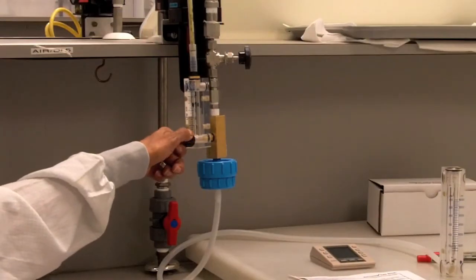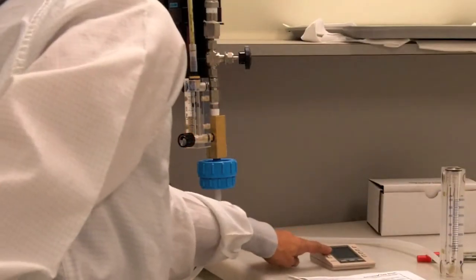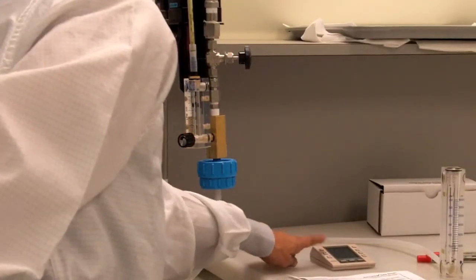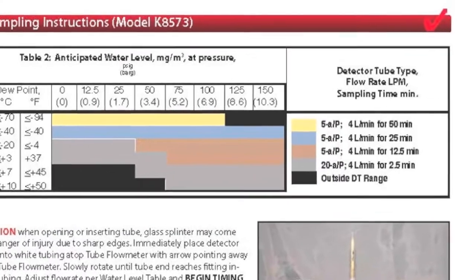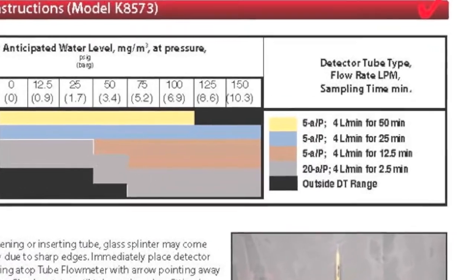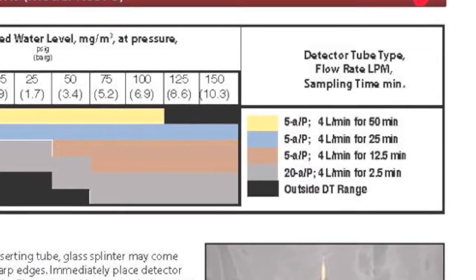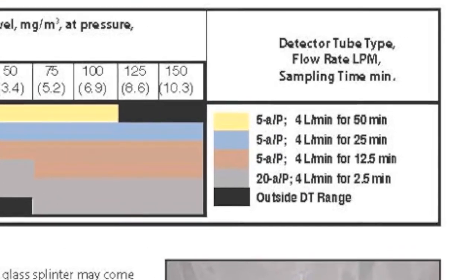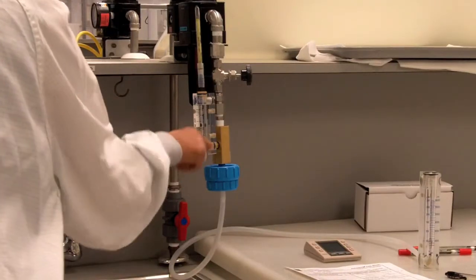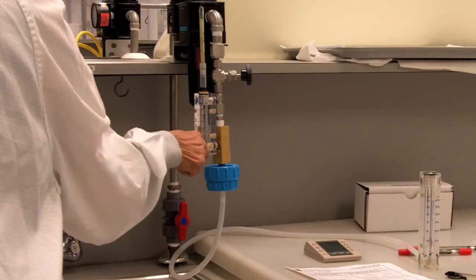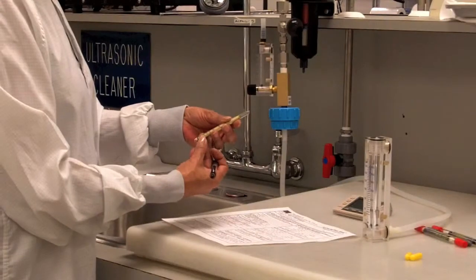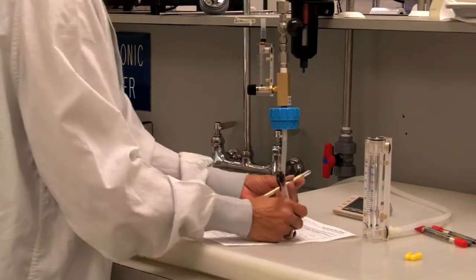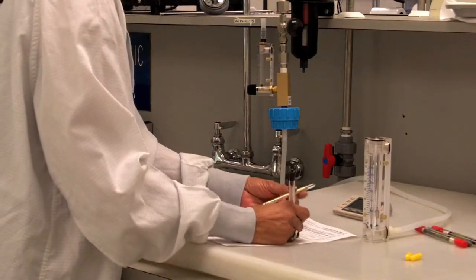Adjust the flow rate to 4 liters per minute if needed and begin the second timer. Sampling times vary from 2.5, 12.5, 25, and 50 minutes, depending on the outlet pressure and the anticipated dew point. At the end of the sampling time, close the needle valve, remove the tube, and immediately read and record the number associated with the color change of the tube on the datasheet.